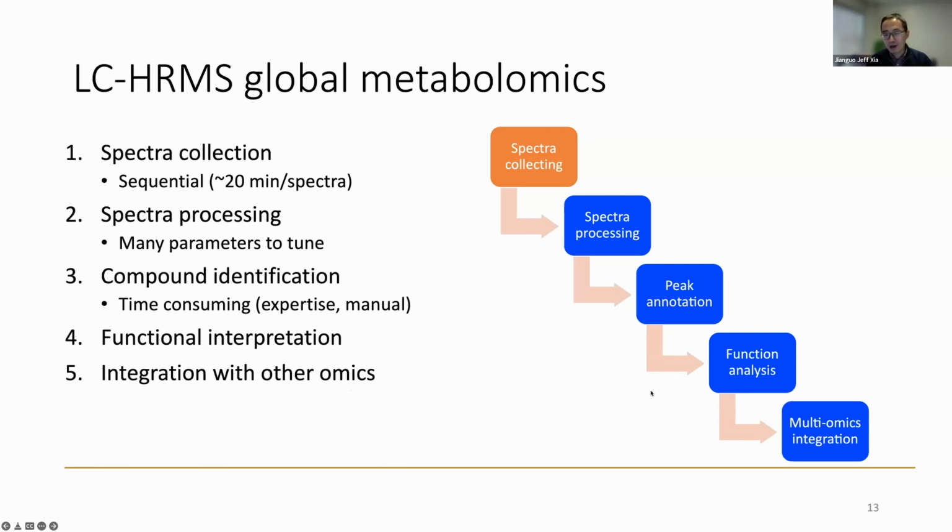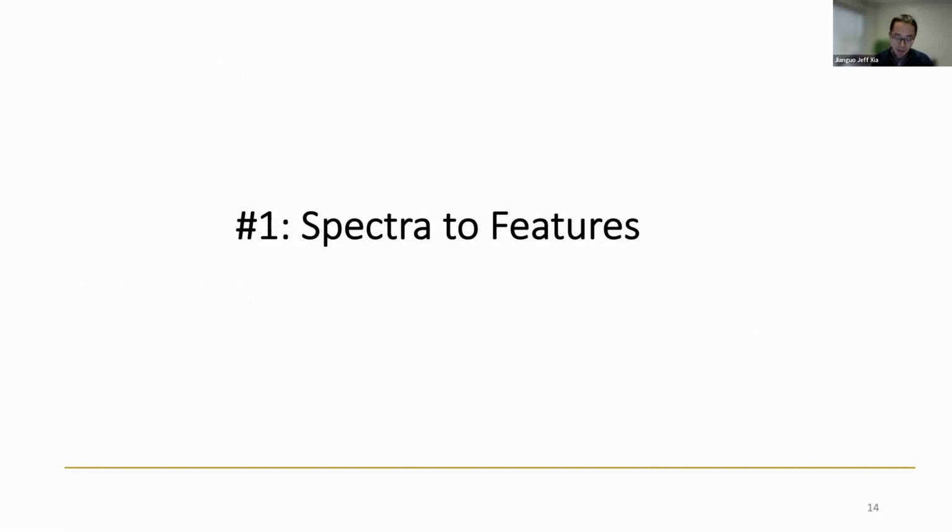MetaboAnalyst version 5.0 is actually driven by this whole process. We want to smooth every step, so you just click your button and move to the next. This is the whole design for MetaboAnalyst 5.0. Let me focus on the spectral to features part.